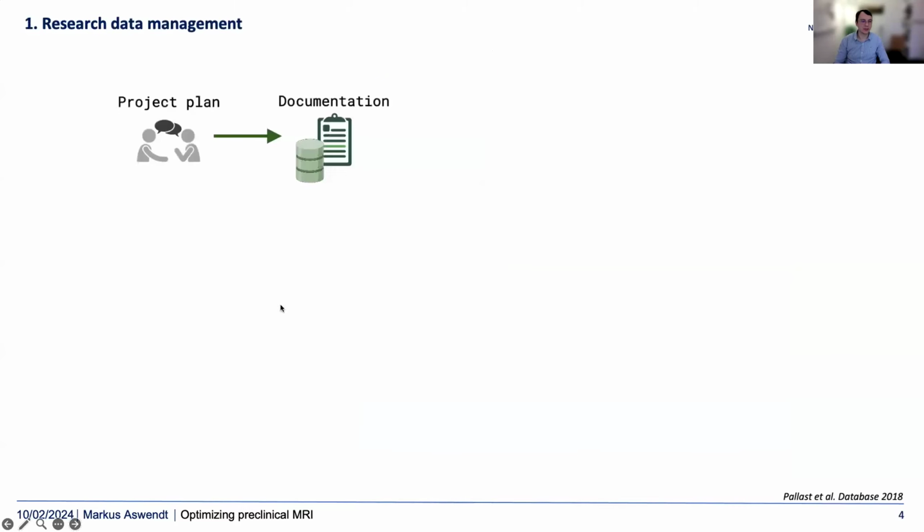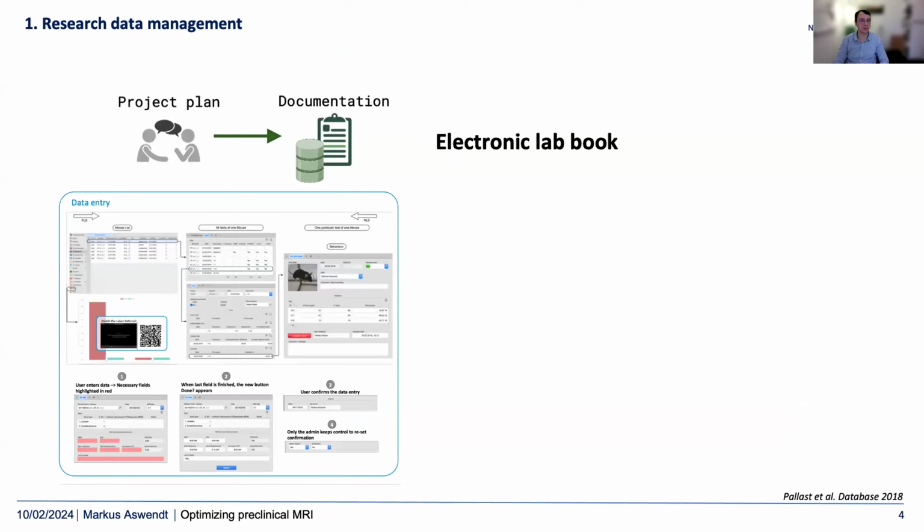Okay, but very briefly, for sake of time, what is this data management and multimodal workflow about? We have in the past, and this is all published, established workflows for how we record metadata in the lab, which is done by an electronic lab book. There are multiple versions out there. We made our own tailored towards our applications, which is not only MRI, but also behavior tests, histology, you name it.